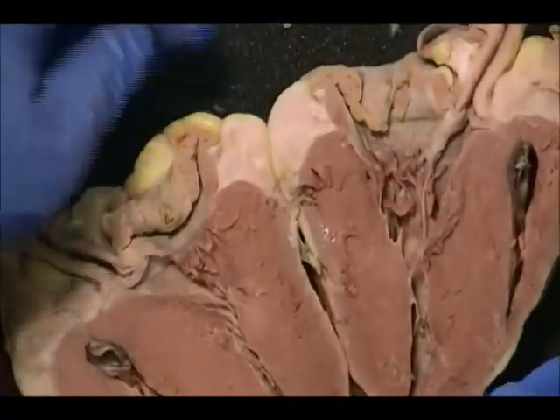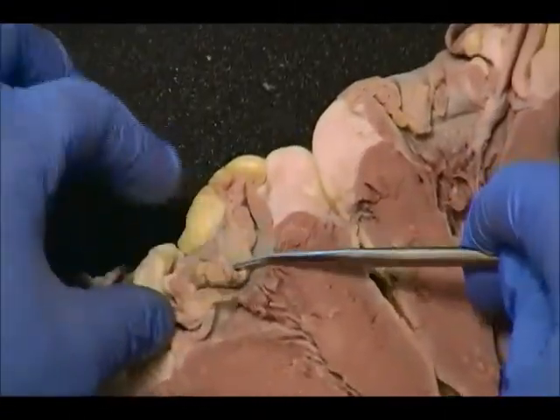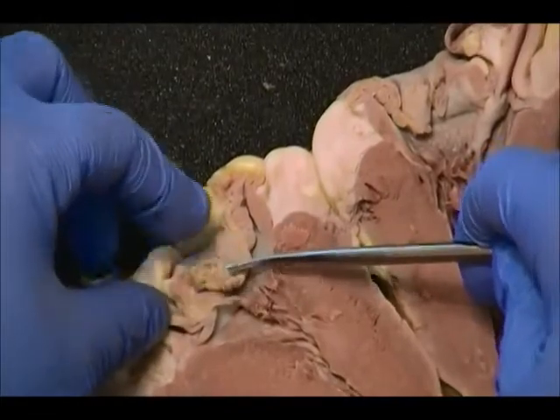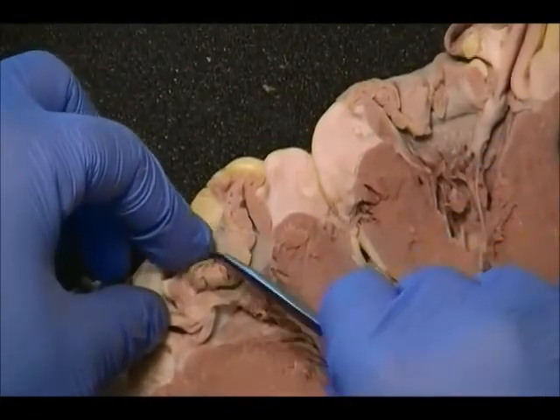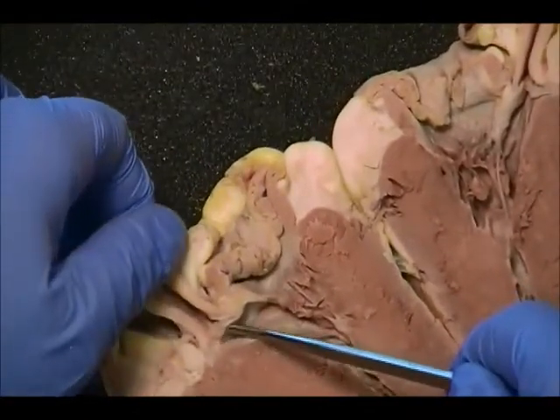The pulmonary semilunar valve is this flap here, would be the pulmonary semilunar valve. And then the aortic valve is here. The aortic semilunar valve is here.